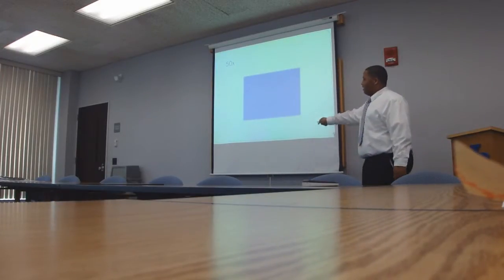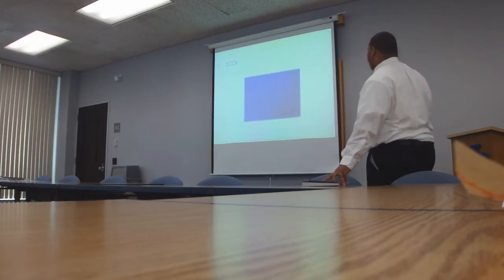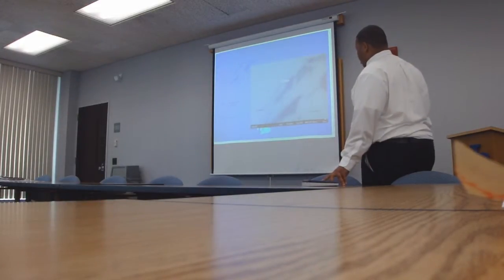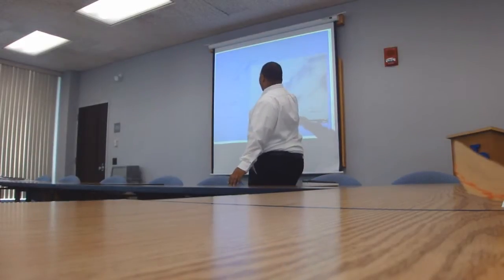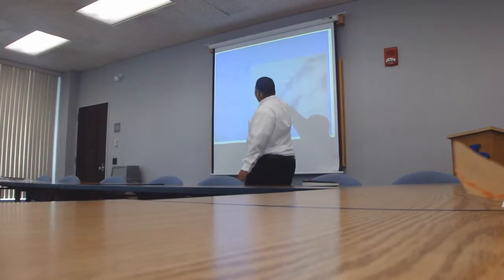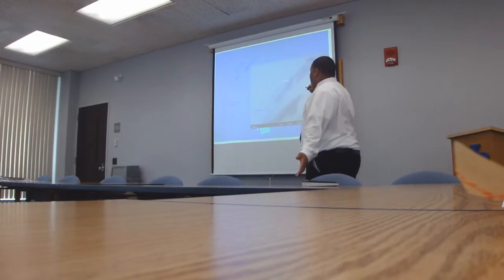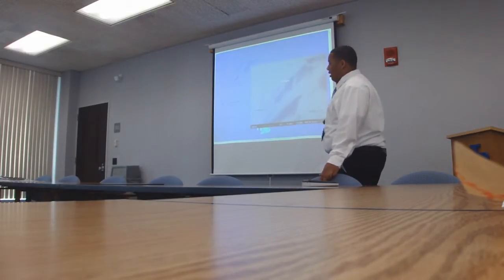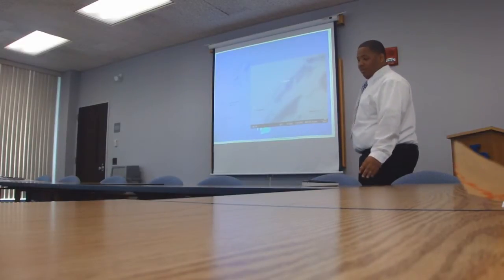But it's a thin piece right there. Then this is a piece in 100x. Basically, this is identifying graphene. Right here is the graphite below graphene. And you can see small pieces like this, like the tell. It's hard to demonstrate or find graphene if you don't know what you're looking for. When I first started, it was hard for me to find graphene. I was under the microscope for hours. I didn't see anything, but there was really something there.